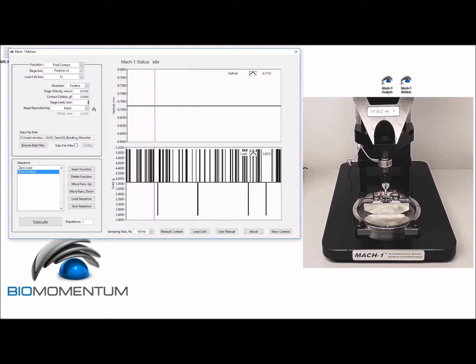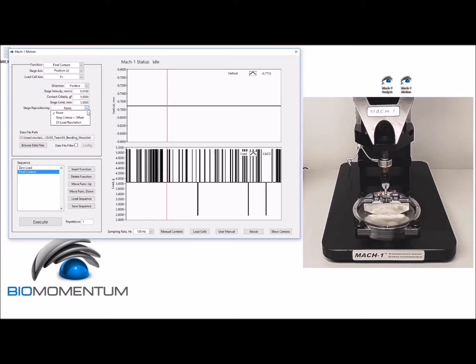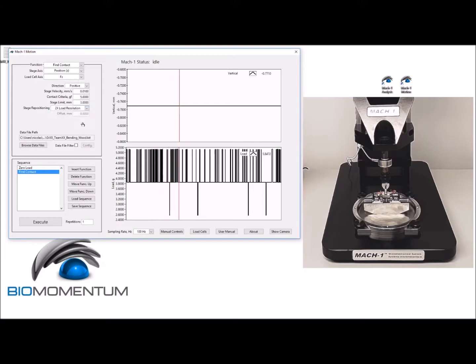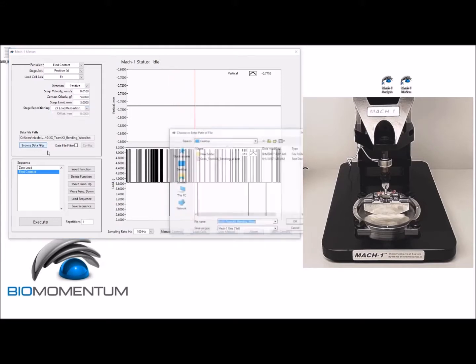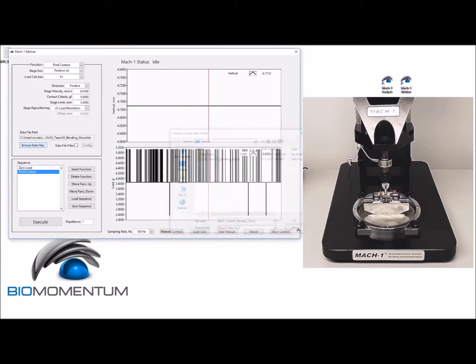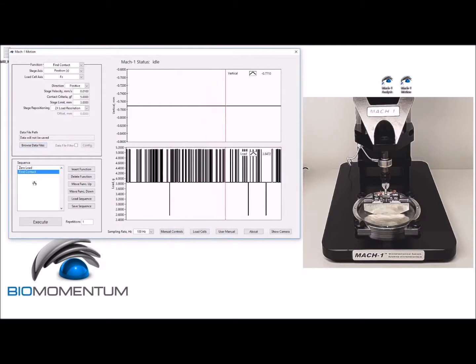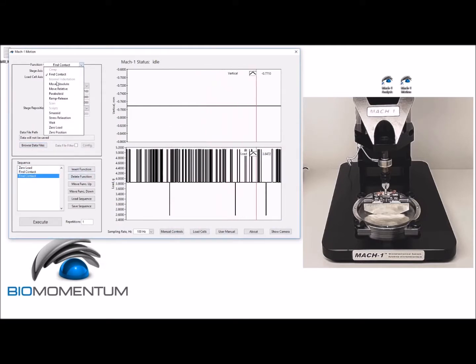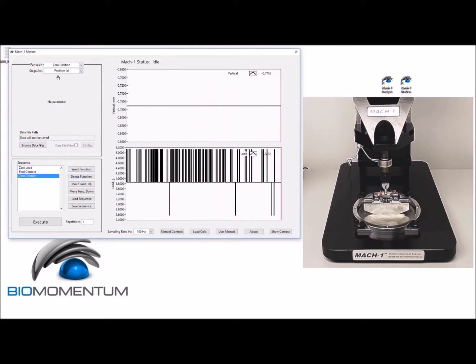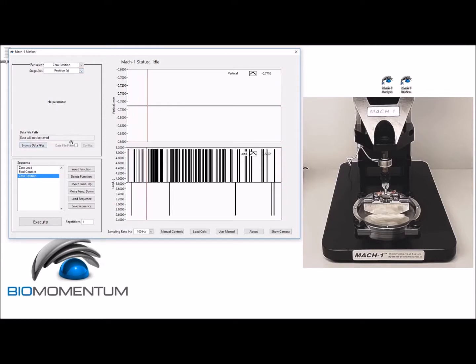limit of 3 millimeters, and a stage repositioning of 2 times the load cell resolution. We will not save the data. Then insert a zero position function with position Z as the stage axis parameter. We can now execute the sequence.